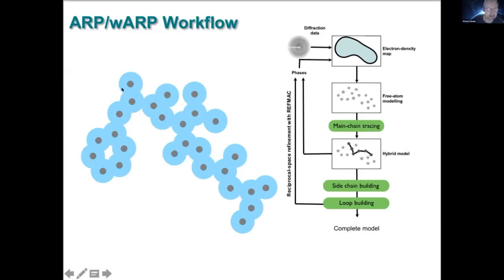And then we take a group of atoms and try to see whether they resemble any known part of a protein structure. Of course, the atoms are not placed ideally at these points, they are subject to pretty big coordinate error, but nevertheless. And if successful, at least a partial main chain could be built, and then subsequently decorated with the side chain. And if this interpretation of the density is correct, then at the next iteration, density will improve, and we will probably build more of the structure.